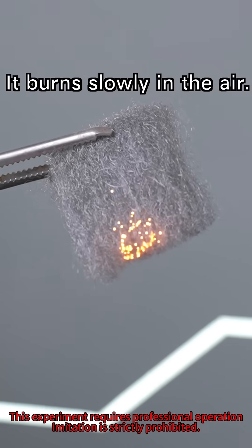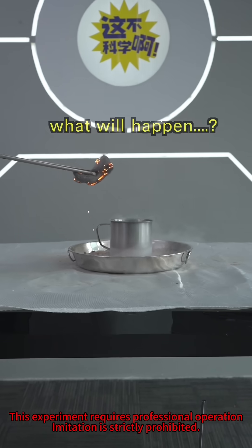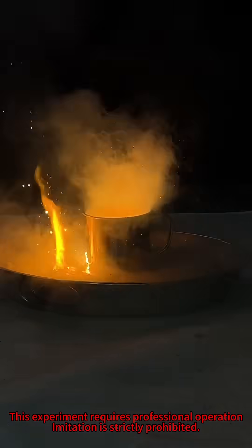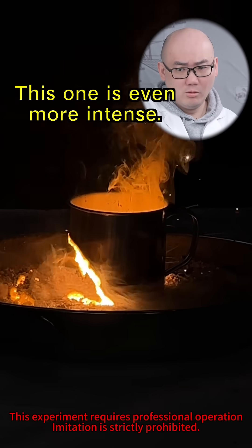It burns slowly in the air. Let's put it into liquid oxygen. Even the iron completely melts! This one's even more intense!